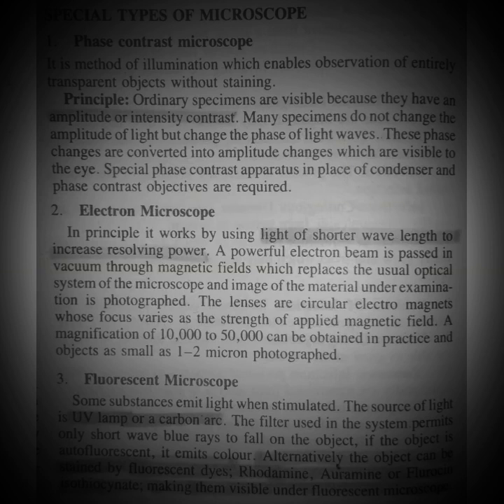So firstly, phase contrast microscope. It helps to make some specific object contrast, like the name phase contrast means that the object you want to see will contrast. Okay, so let me read it. It is the method of illumination which enables observation of entirely transparent objects without staining.